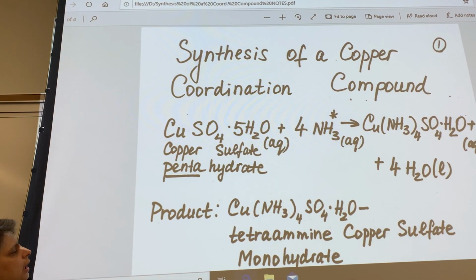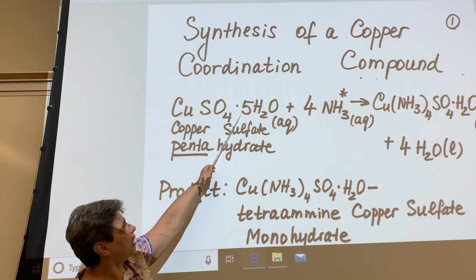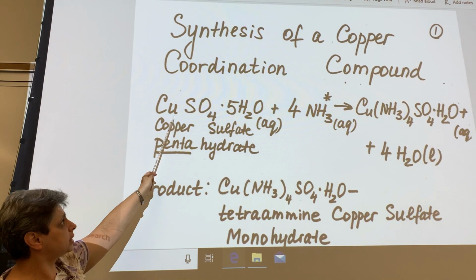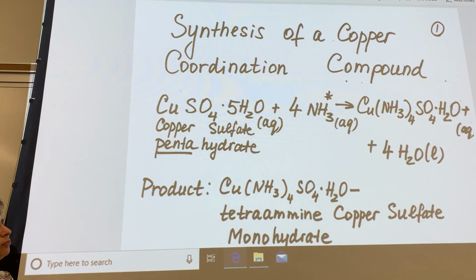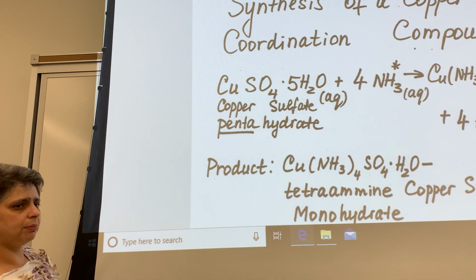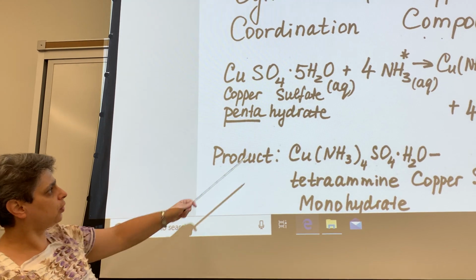What does that mean? Well, there are several things that you need to know. First, this means that the solid material does contain 5 water molecules per 1 copper sulfate unit. It may seem weird that water is present in the solid, but in fact in chemistry it's quite common for solids to contain water. Such substances are called hydrates.